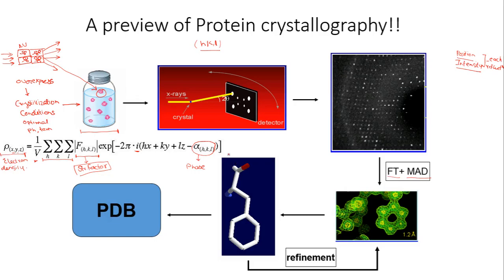Typically, or practically, what happens is that the biophysicist gives the position and intensity to some computer program, and eventually it generates the electron density map. This is what happens at the theoretical level in the background. I thought it would be better for you to know what the structure factor is, what phases are, and what the phase problem in crystallography is.